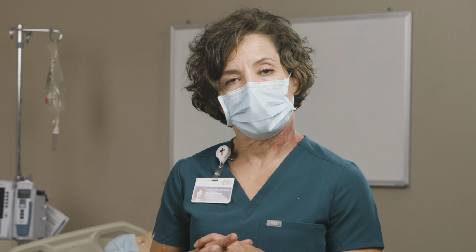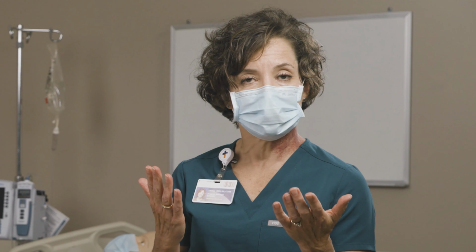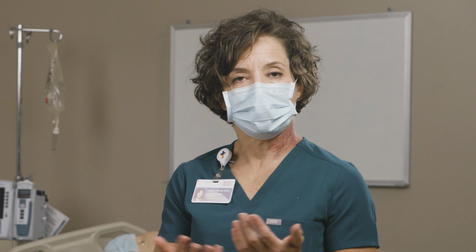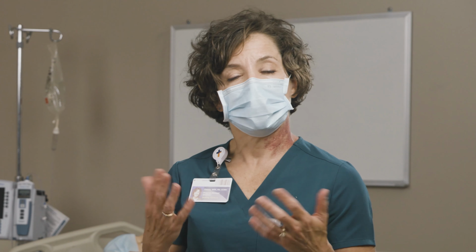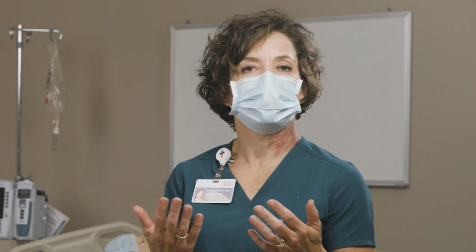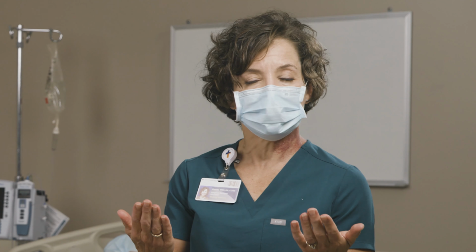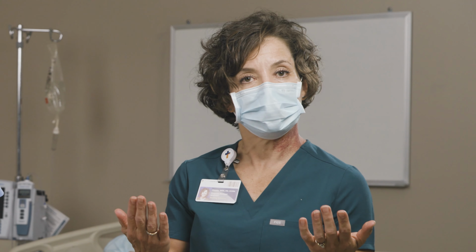And really the rationale behind using the second pair of gloves is so that you have that pair of gloves on when you go to disinfect your CAPR, and you don't have to hand sanitize, wait for your hands to dry, and then don a second pair of gloves. So that's the rationale behind why we use the two glove method. Both methods are fine to use with both ensembles of PPE.